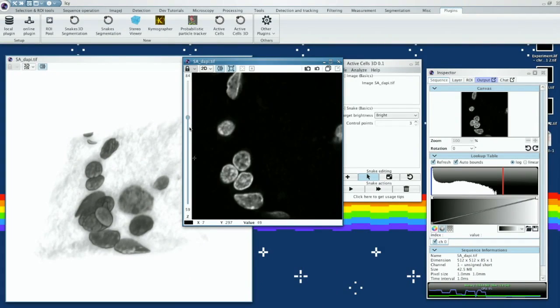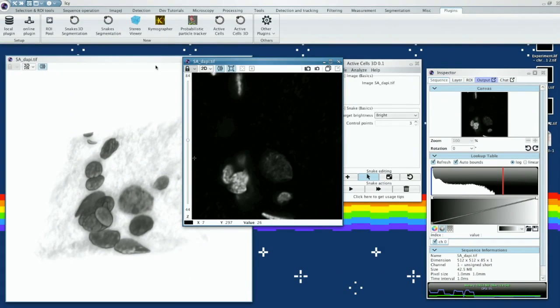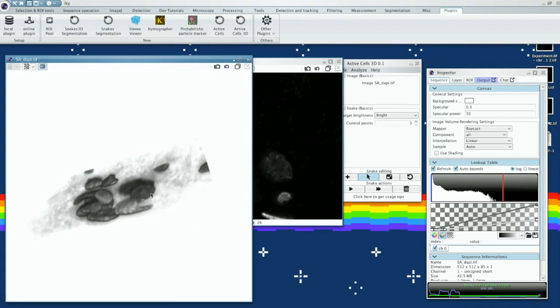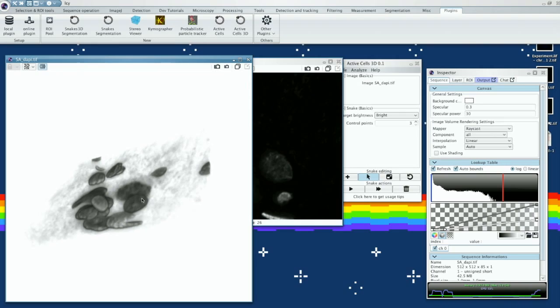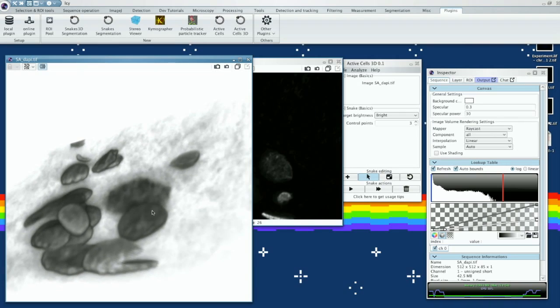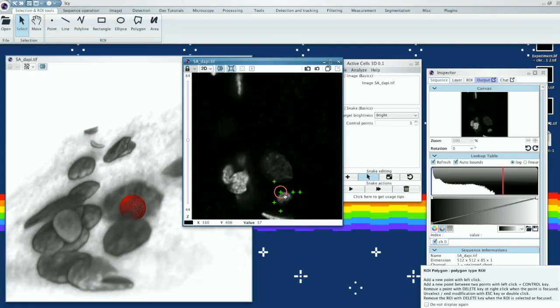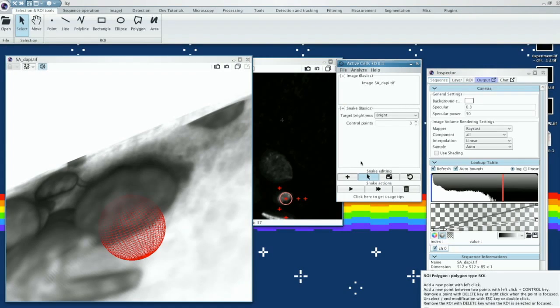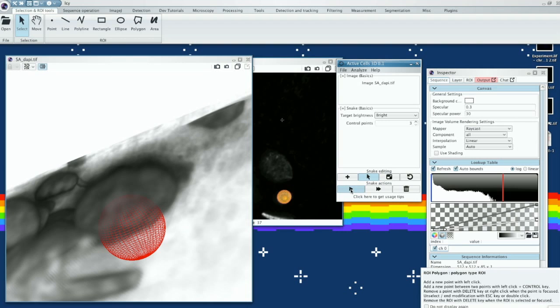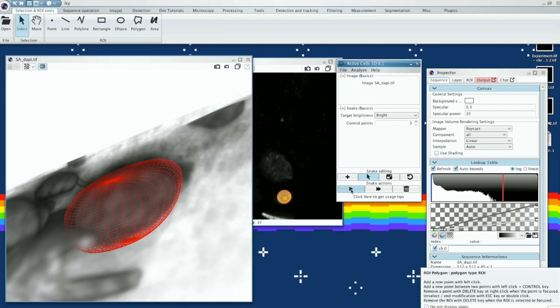What our software provides is different visualizations of the image data that the biologists have. From there, they just choose an initial position in our program to start, and a sphere appears. They drag it with a mouse close to the cell they want to analyze, click a button, and the sphere automatically adjusts to the cell.